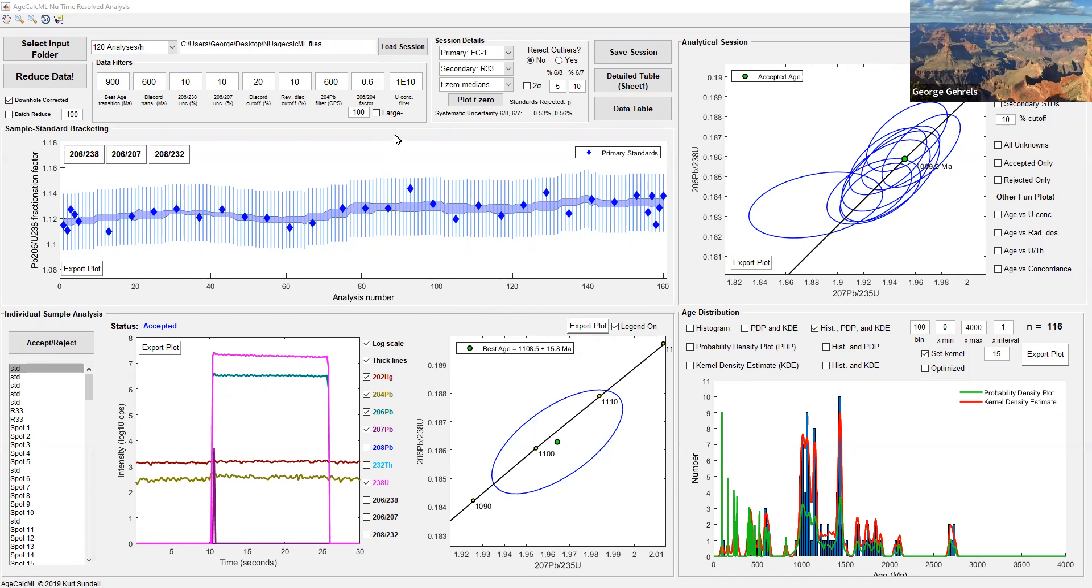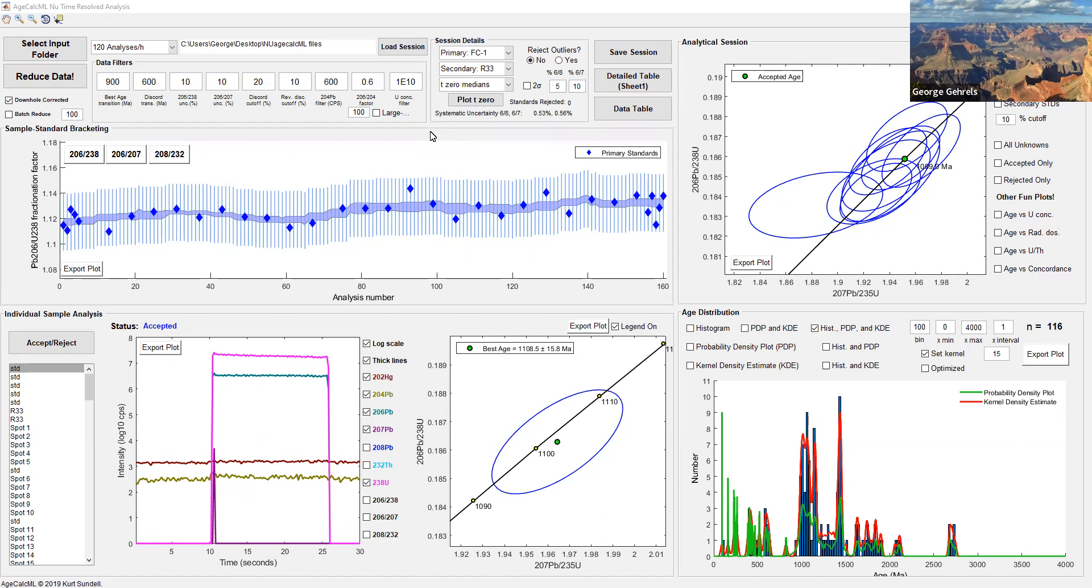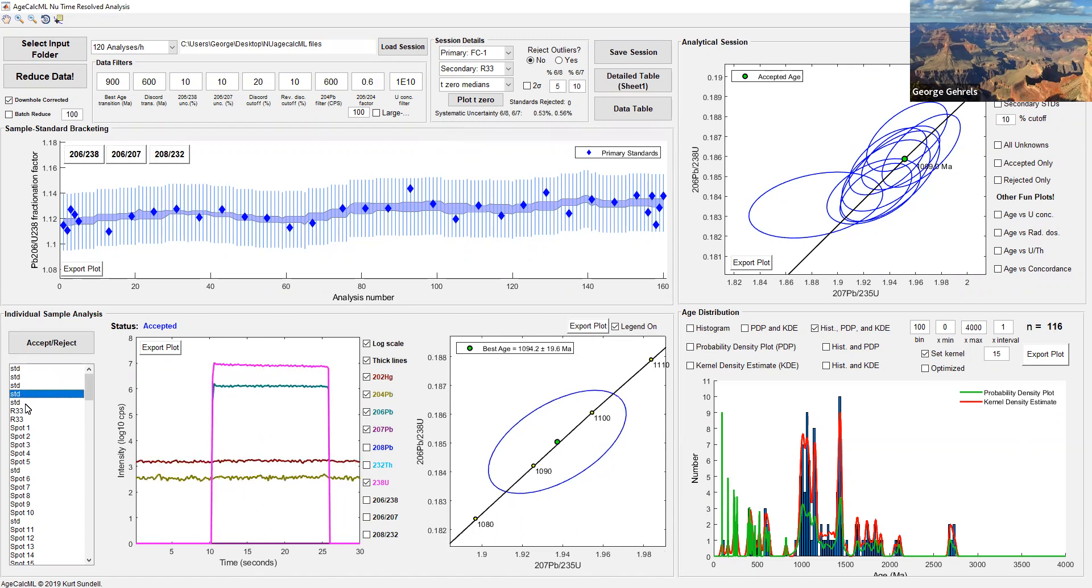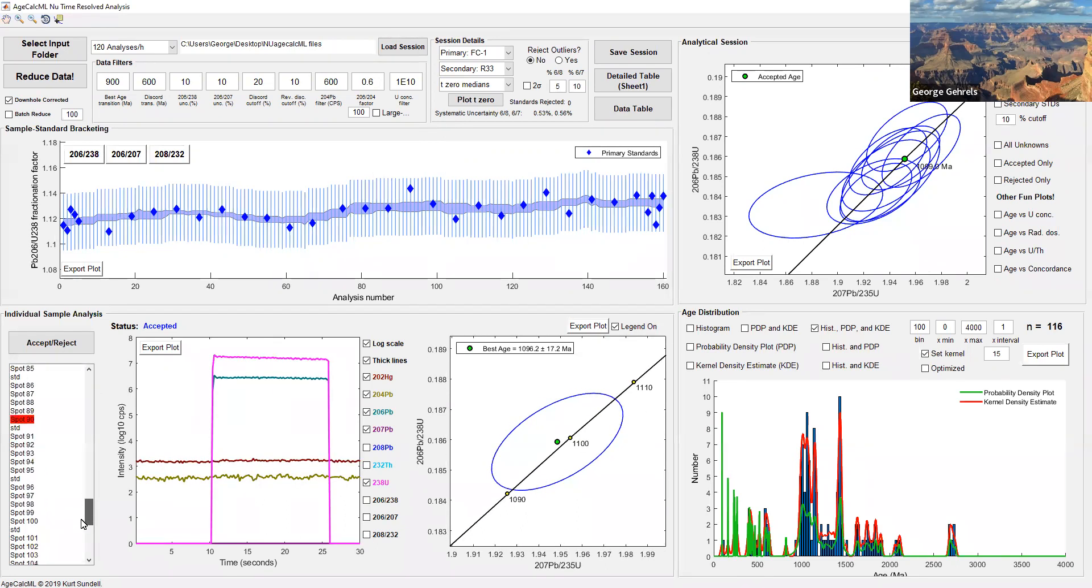Let's start off with the main interface of our uranium-lead data reduction software. This is programmed in MATLAB. The programming was done by Kurt Sundell as part of his postdoc here at the Lasertron Center. The nuts and bolts of the data reduction software are what we refer to as age calc. This is a data reduction scheme I've been working on for pretty much 20 years now. We started in the early 2000s doing uranium-lead geochronology by laser ablation ICP-MS. Down in the lower left corner, we see a list of all the analyses we've done for this sample, about 160 total.